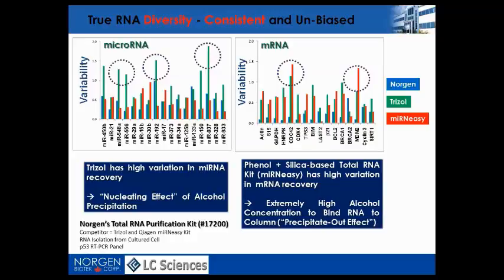So providers of various RNA extraction kits have to modify the existing protocols to fit these requirements, to capture low RNA inputs, for example from plasma, also with higher consistency. This table shows that some extraction methods are now combining phenol-chloroform for the isolation of small microRNA, followed by a cleaning step on a silica-based column to remove any inhibitors. Still, this is time-consuming, using hazardous material like phenol, and it's not going to be cost-effective anymore.